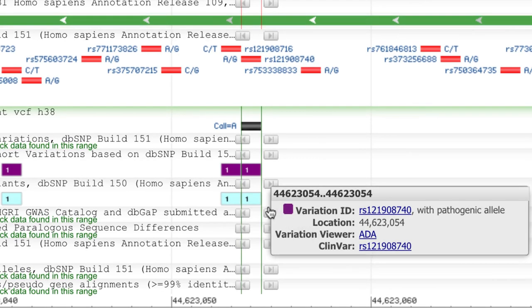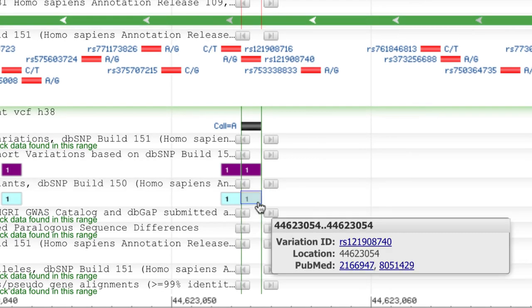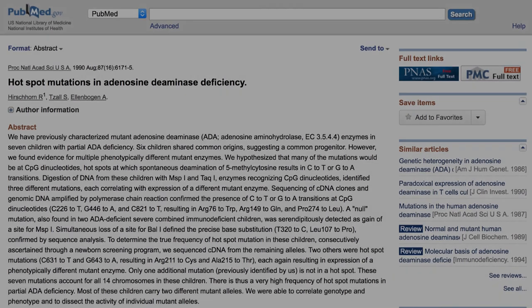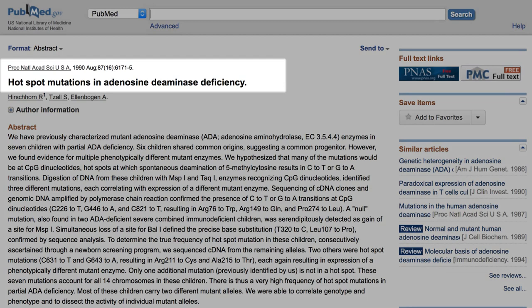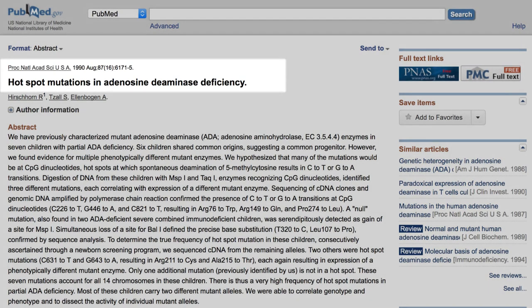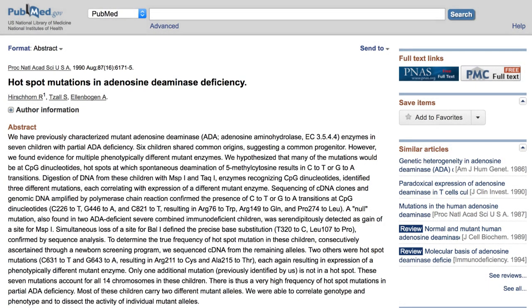The other track with data is Cited Variants. Let's take a quick look at one of those PubMed abstracts. Well that's intriguing. This location has been identified as a mutational hotspot in ADA deficiency. Let's see what else the viewer can tell us.